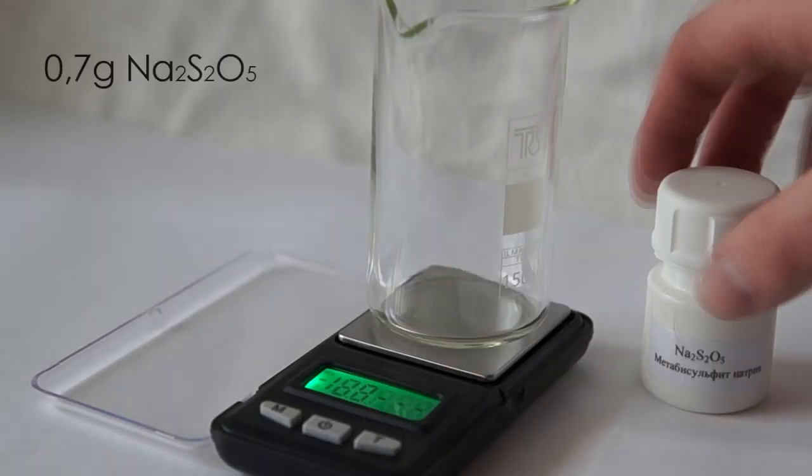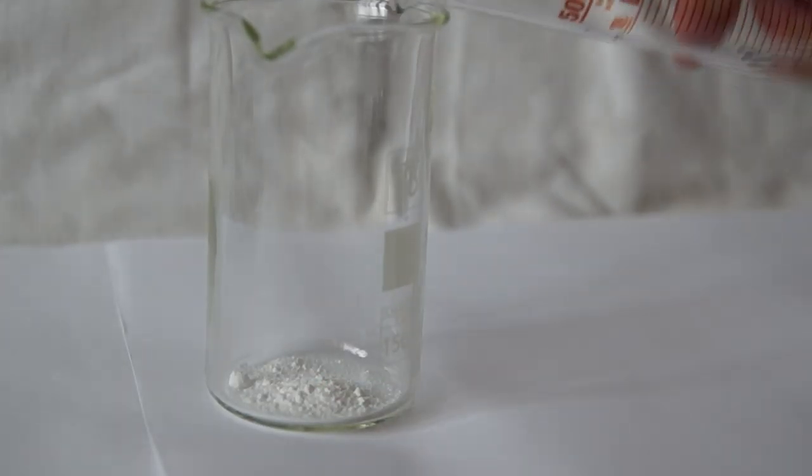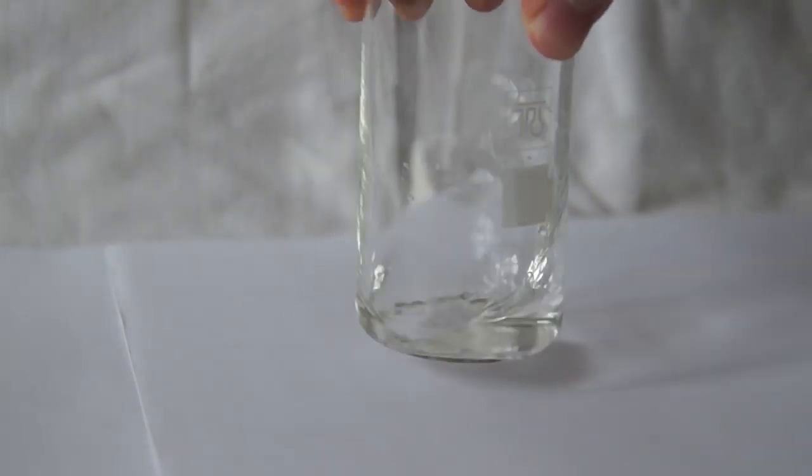For the first solution take 0.7 g of sodium metabisulfite and dissolve it in 20 ml of distilled water.